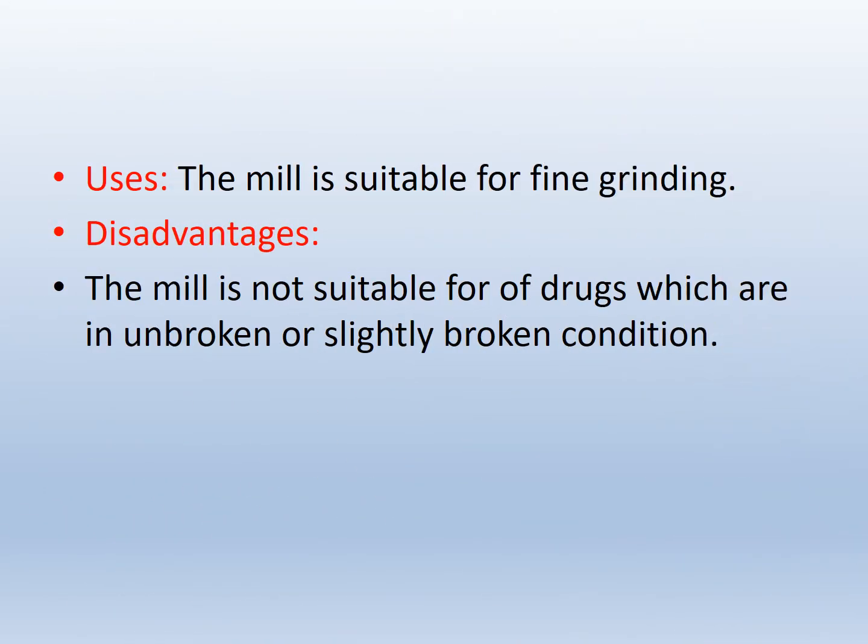Uses: the mill is suitable for fine grinding. Disadvantages: this mill is not suitable for drugs which are in unbroken or slightly broken conditions.